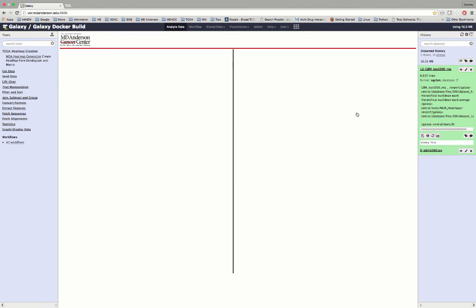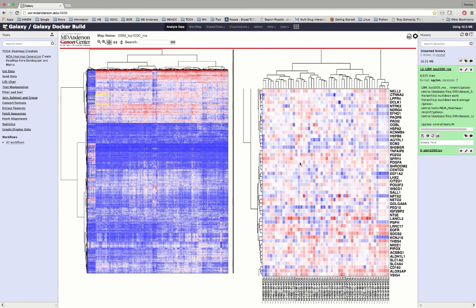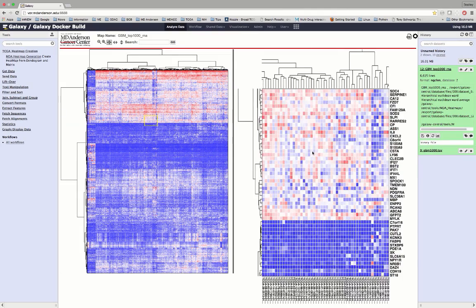This new version of the NGCHM visualization system has been extensively rewritten to exploit recent advances in the capabilities of modern browsers. It delivers a very dynamic user experience.